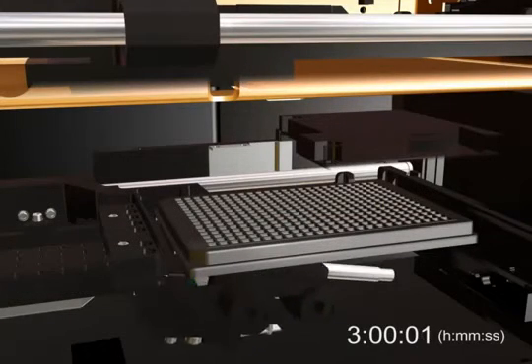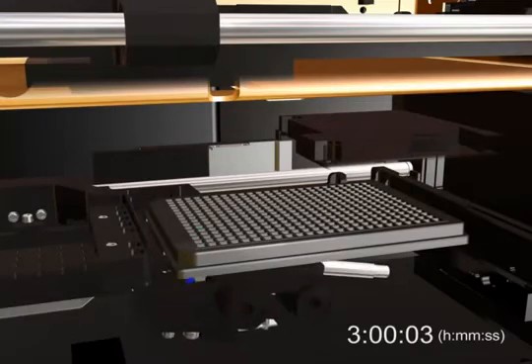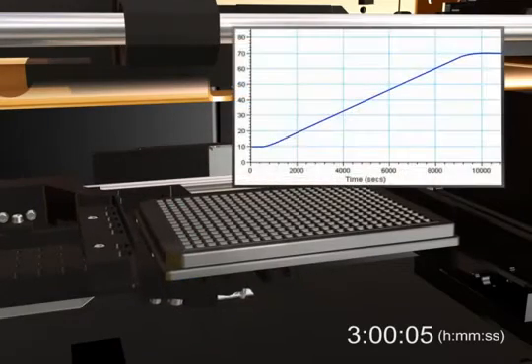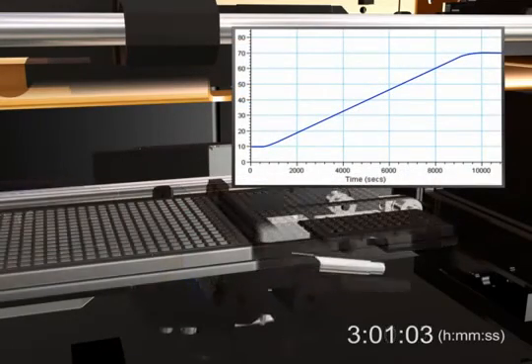After 3 hours, our kinetic read is complete. We can now analyze the results with Softmax Pro software.